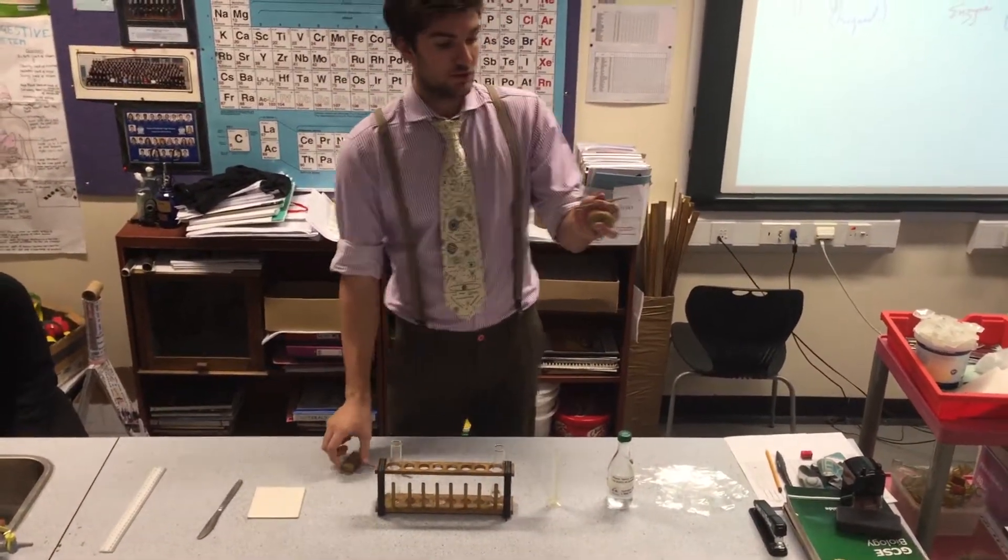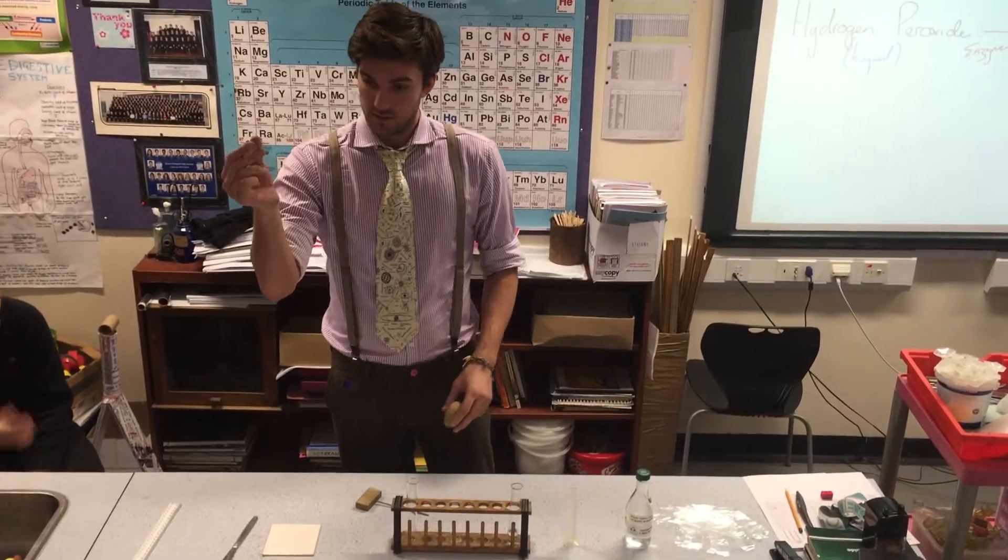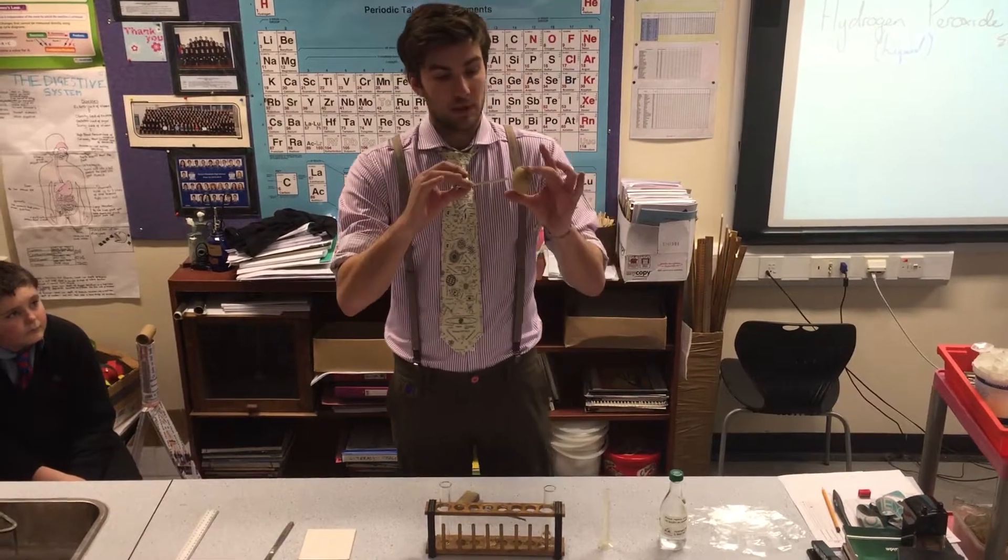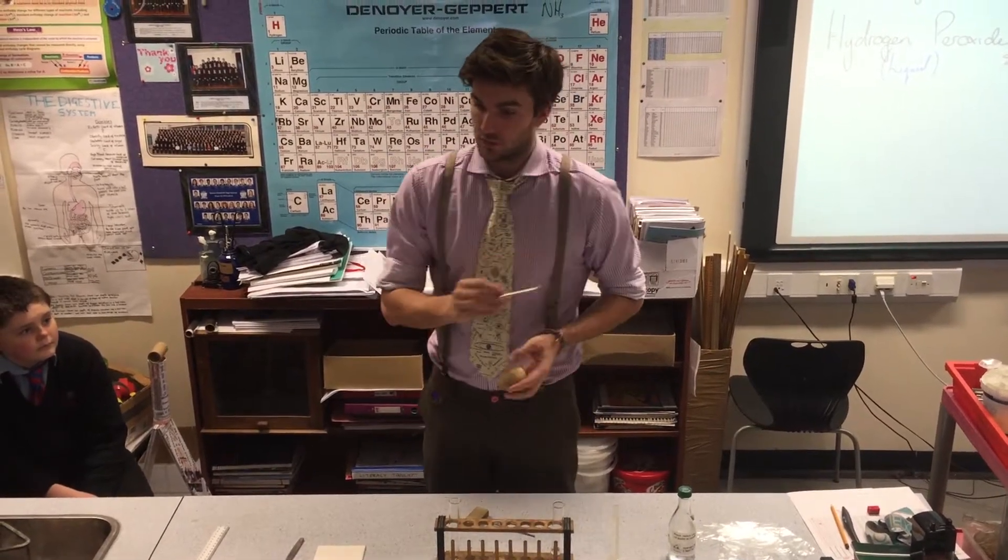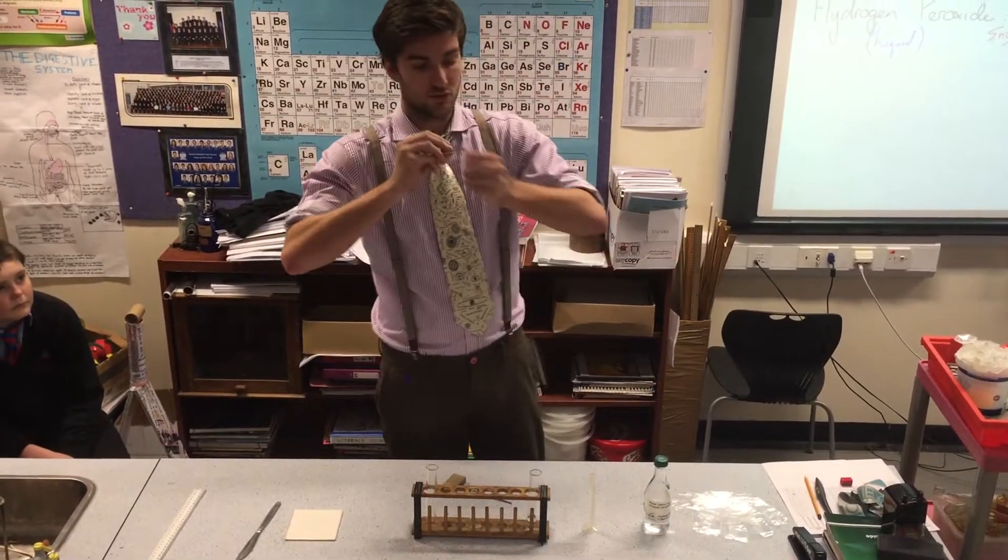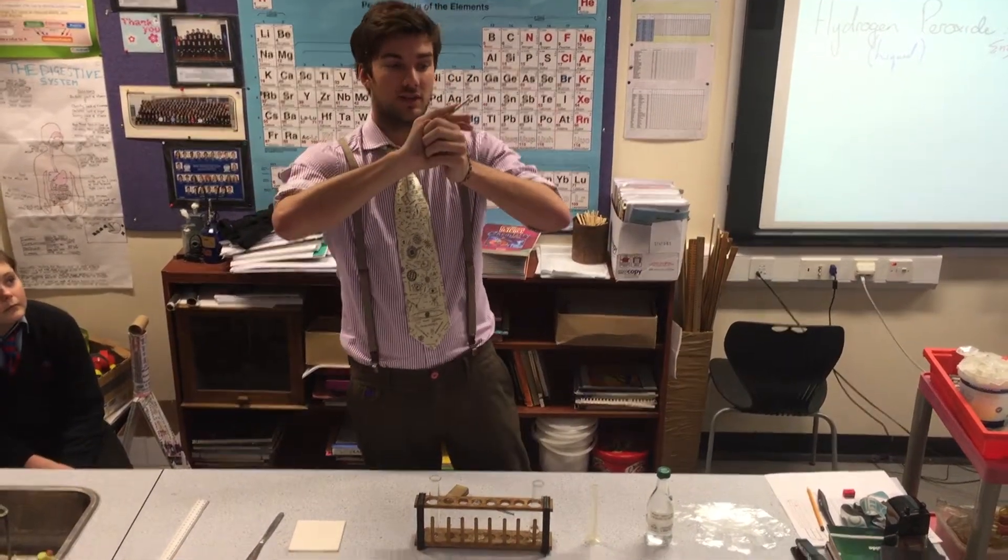Simple. What you do, you get this end which is not connected to the wood, and you're going to place this through the potato in one smooth action. Do not do that, because this will go straight through into your hand.